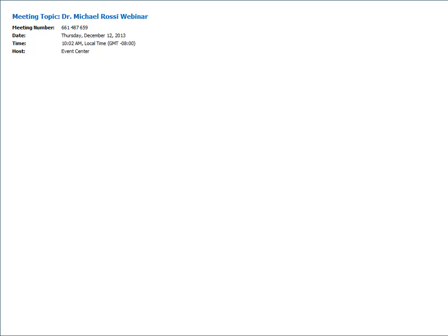And in human stuff, PacBio just has not been very useful for anything that we've done. But with other applications, it can be.